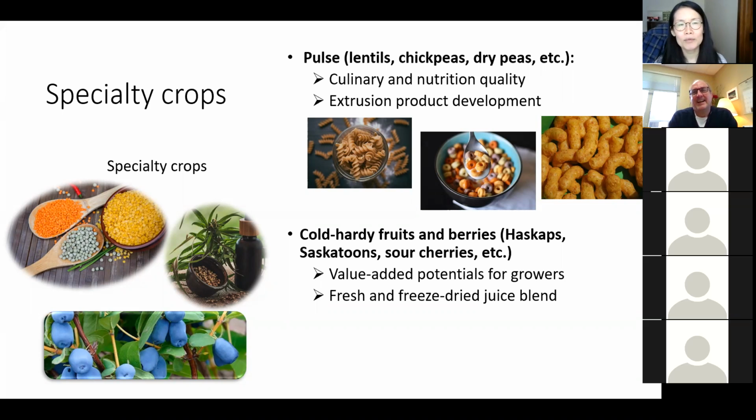I only knew that in terms of protein, it depends on year and region. Sometimes they have limited regional data. They just sample a little bit of protein content and it seems to be better or worse. So there really is no statewide data. We're going to collect from different regions like North, Central, East, and Southwest and compare the same variety with other regions, like central Washington. But I can ask the person we partner with, because they are the pulse supplier group gathering pulses from different regions in Montana and also from North Dakota, and see about transportation. So that's a good point.